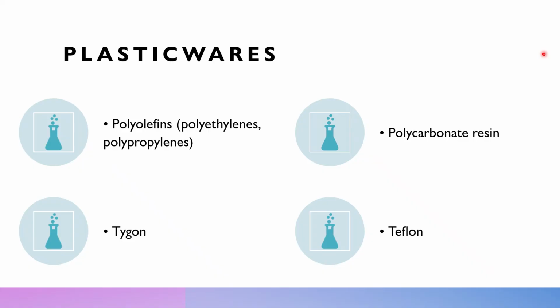Many laboratories use automatic dishwashers and dryers for cleaning. But do not forget, class, that detergents and temperature levels should be compatible with the material and the manufacturer's recommendations. To ensure that all detergent has been removed from the labware, multiple rinses with appropriate grade water are also recommended.